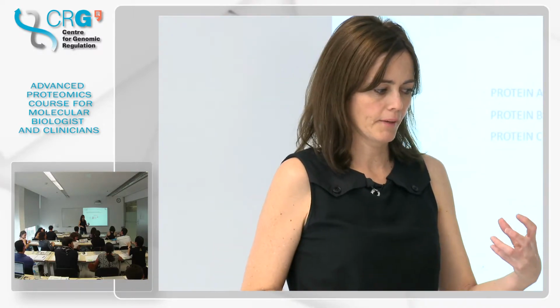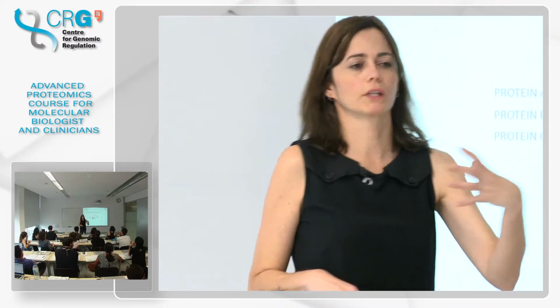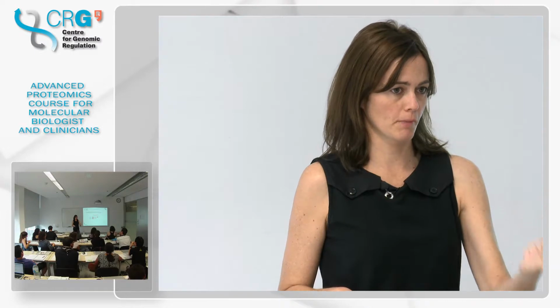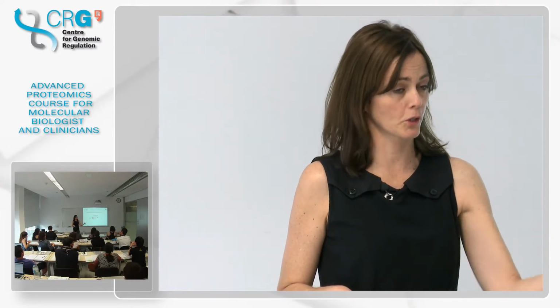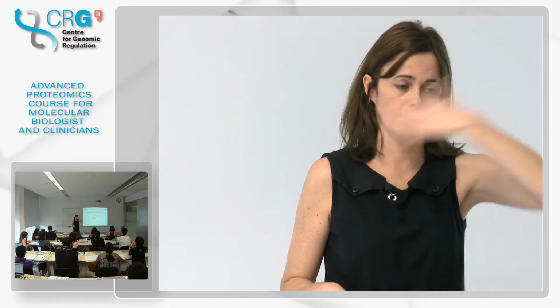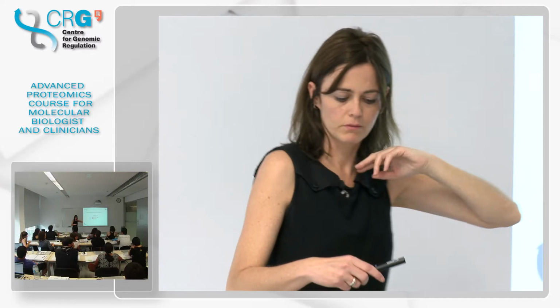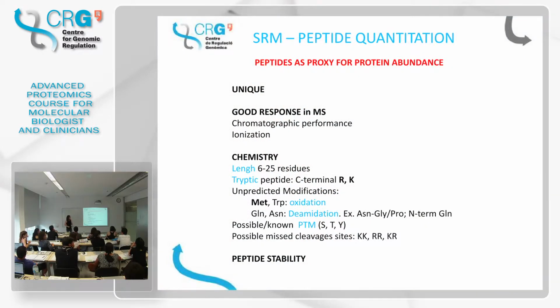Yeah, but you are going to look for this best peptide to monitor in your mass spectrometry data. So you are going to see if, when you process your sample, you find this peptide. If this peptide is cleaved, you are not going to find it, only from shotgun data you already have. But the peptides that are unique, normally they should be very long? Not necessarily.